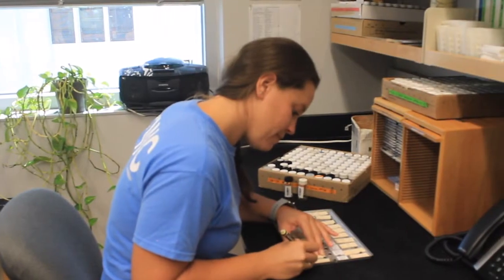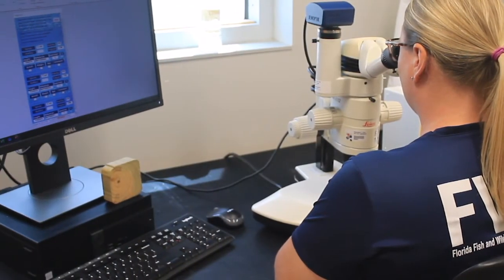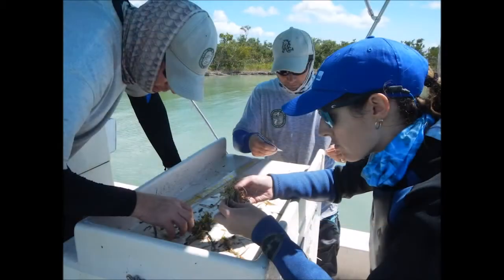Our age and growth lab processes and ages about 30,000 otoliths per year from about 70 species of fish. These ages are combined with other data including lengths, weights, reproductive information, mercury content, diet, and catch data.